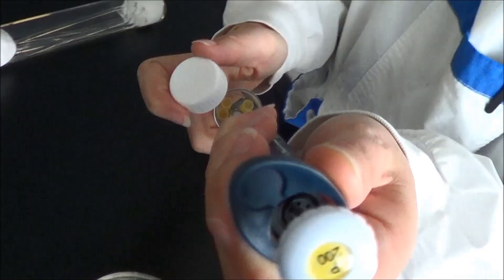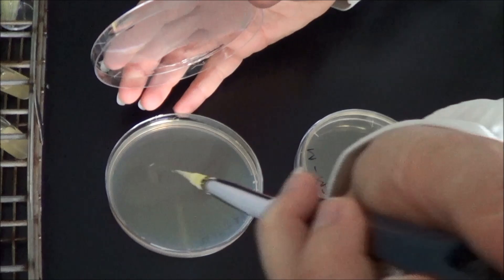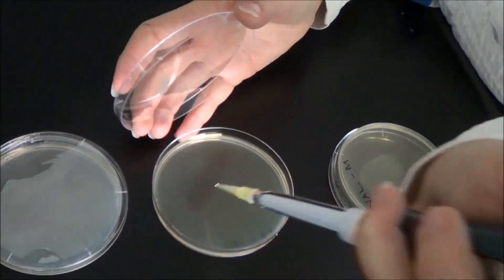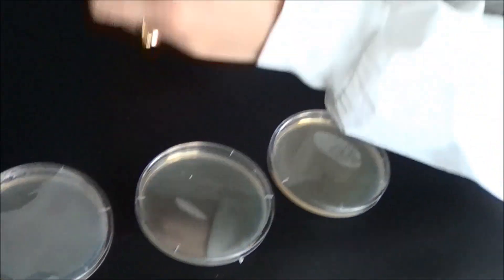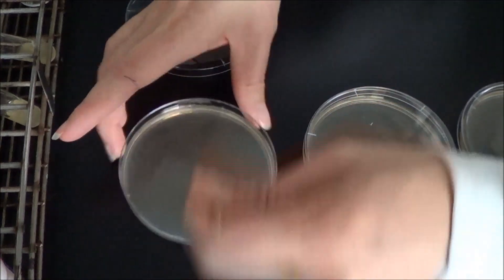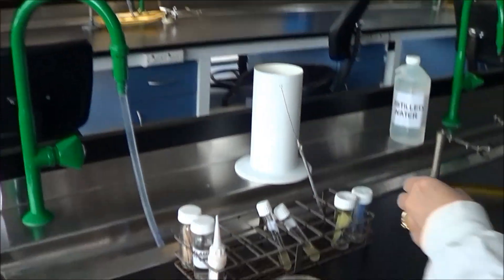Then add 0.1 ml of the mutagenised culture onto another three antibiotic agar plates, and spread again using the spreader.